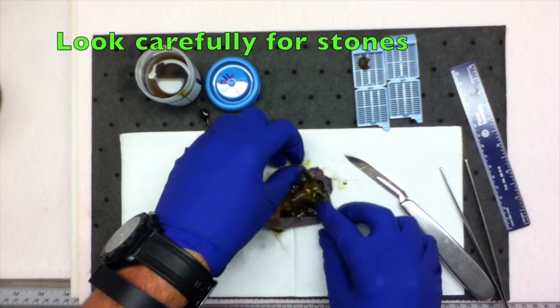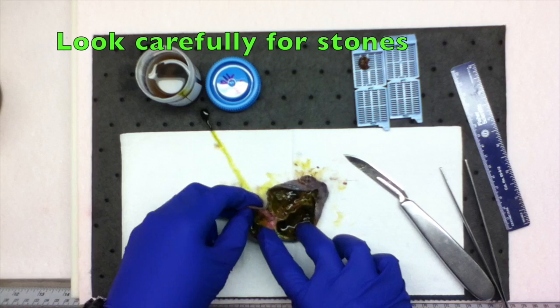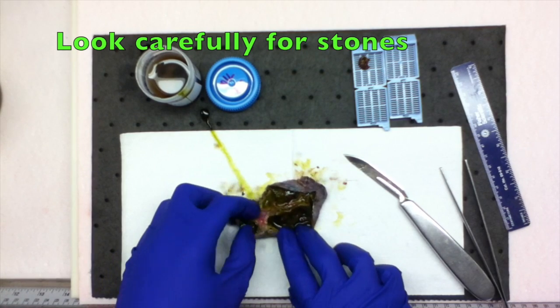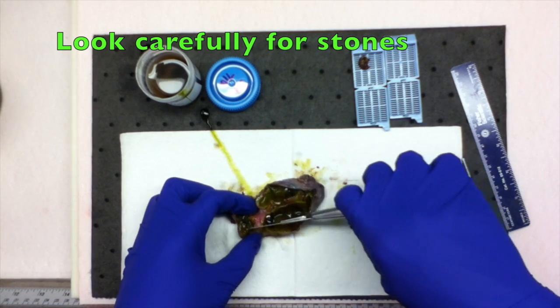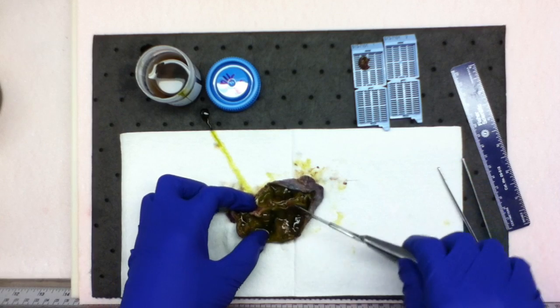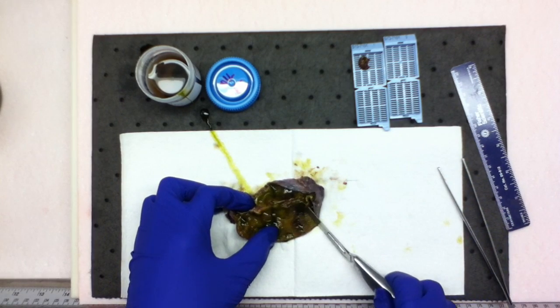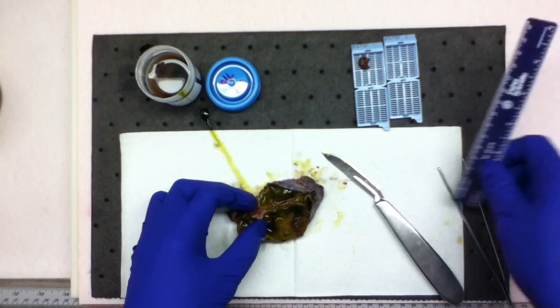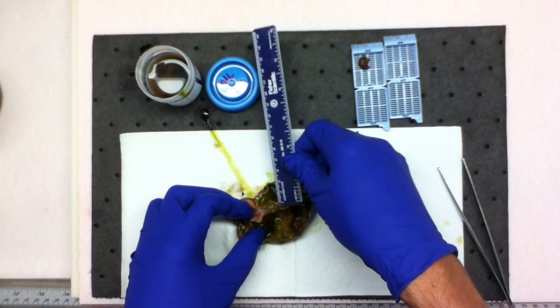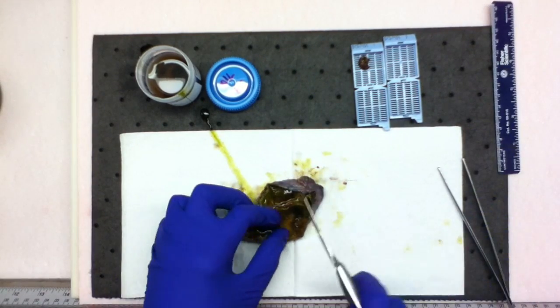Opening reveals abundant amounts of dark green viscous bile and no stones. The mucosa is dark green and granular. Wall thickness averages 0.3 cm.